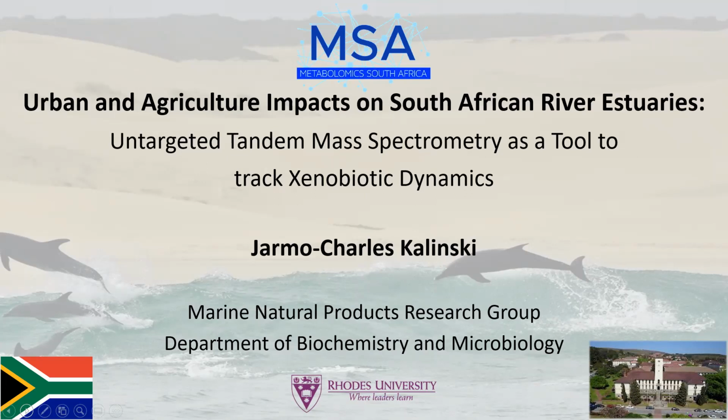So the aim was to assess the utility of untargeted metabolomics to annotate xenobiotics of concern, as well as their distribution in DOM within the Algoa Bay system. So he employed reverse phase UHPLC-MS and positive mode electrospray ionization on a quadrupole-Orbitrap mass spec for untargeted screening of xenobiotics and approximate quantification with authentic standards of various compounds given there. I think he'll give us all the full names and correct pronunciations of them.